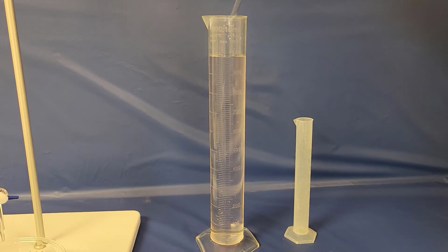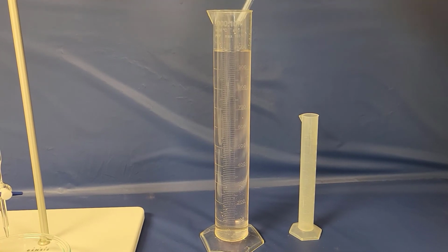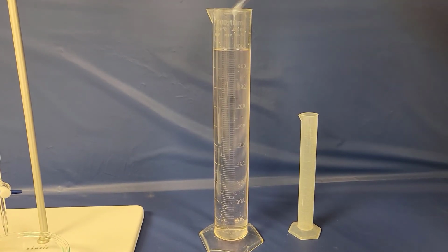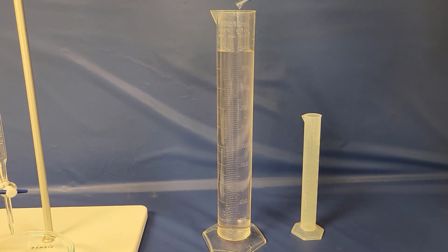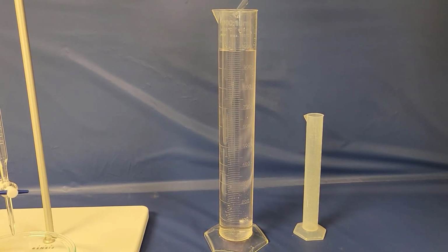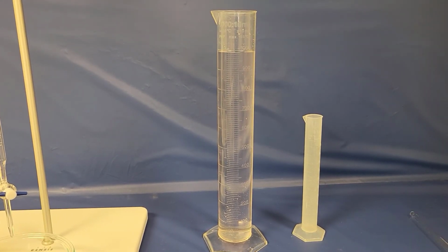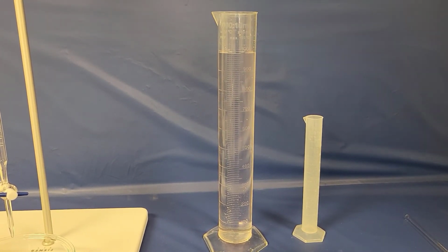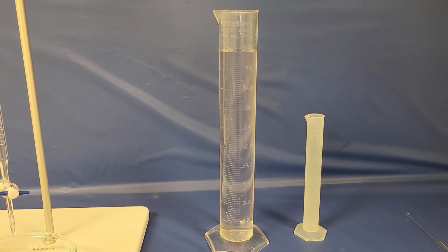All right, now we need to take that solution and mix it with more distilled water. The reason why we're not just mixing this directly, and doing a little bit of dilution, is that you'd have to have a really big cylinder that you can measure accurately. When you dilute it a little bit, it allows you to get a small amount of acid and a larger amount of water without having to have a big container of water.